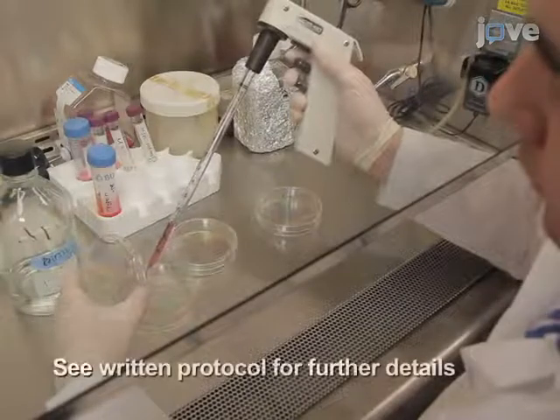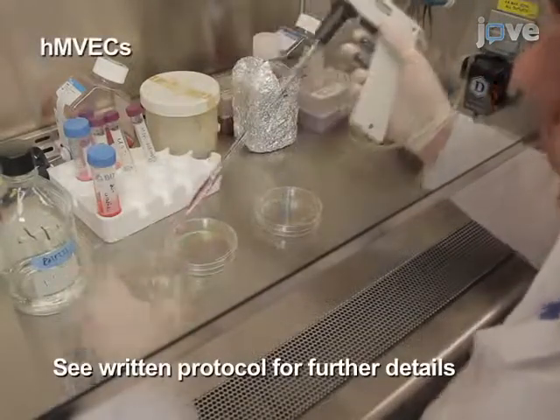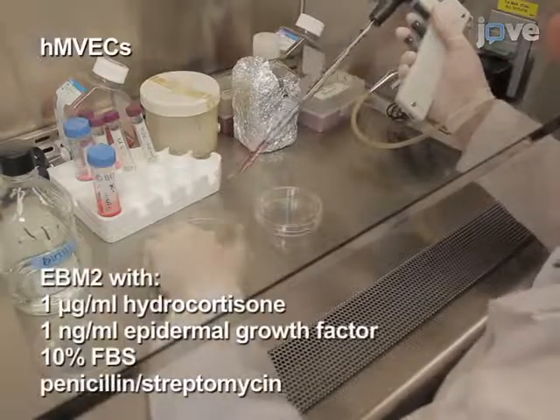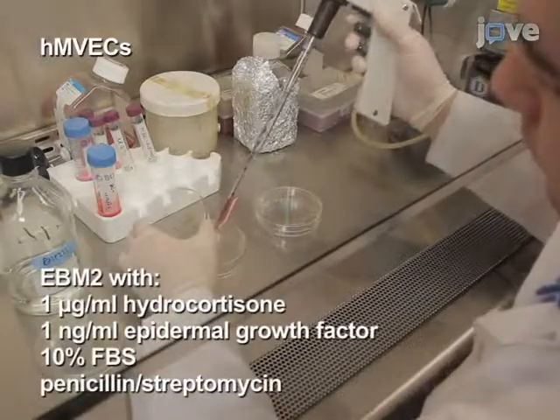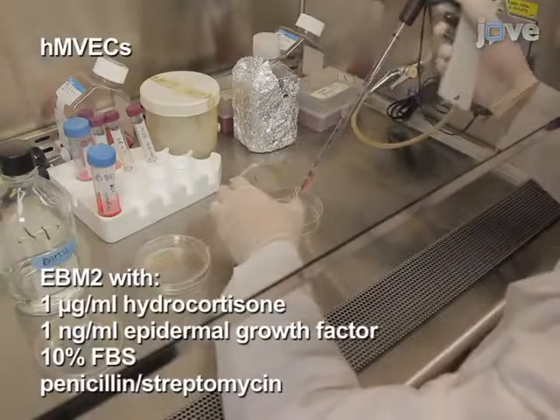Culture human microvascular endothelial cells, or HMVECs, in EBM2 medium supplemented with 1 µg per milliliter hydrocortisone, 1 ng per milliliter epidermal growth factor, 10% FBS, and penicillin-streptomycin.